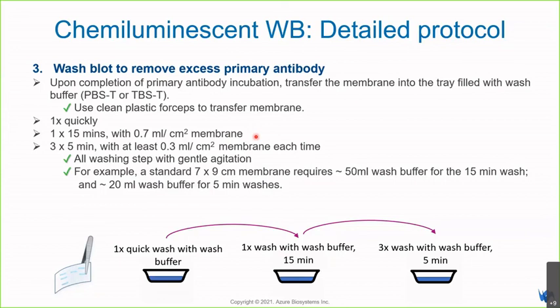We'll say that this is the minimal requirement of the volume that you should use. For example, a standard 7 by 9 cm membrane will require almost 50 mL of wash buffer for the 15 minute wash, and around 20 mL of wash buffer for the 5 minute washes.